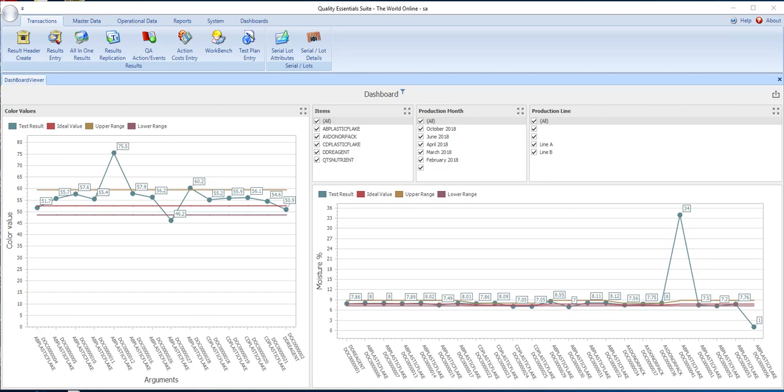In this video, I'm going to show you how to use our test plan entry functionality and some of the features that it can provide. This new functionality was built for customers who require testing on their lot numbers at different times on an ongoing basis. For example, a company that produces PVC pipe extrudes the PVC pipe all day and considers it to be a single lot number.